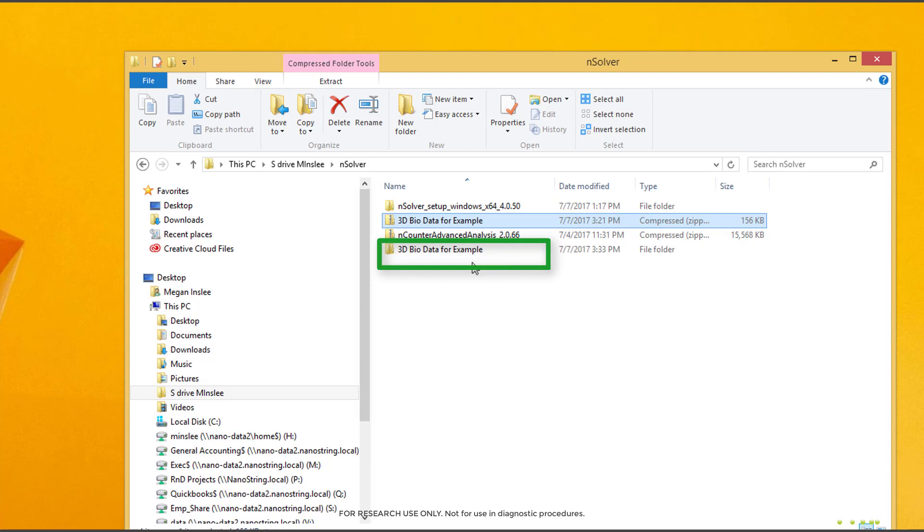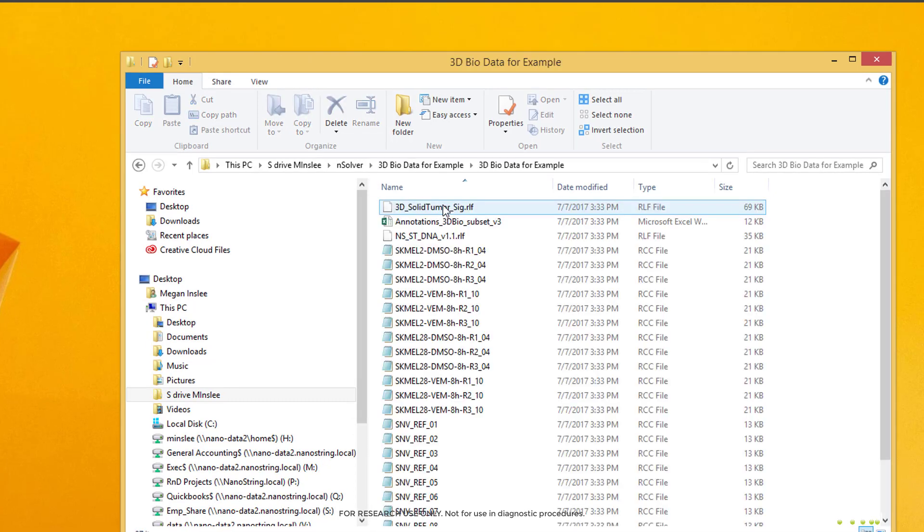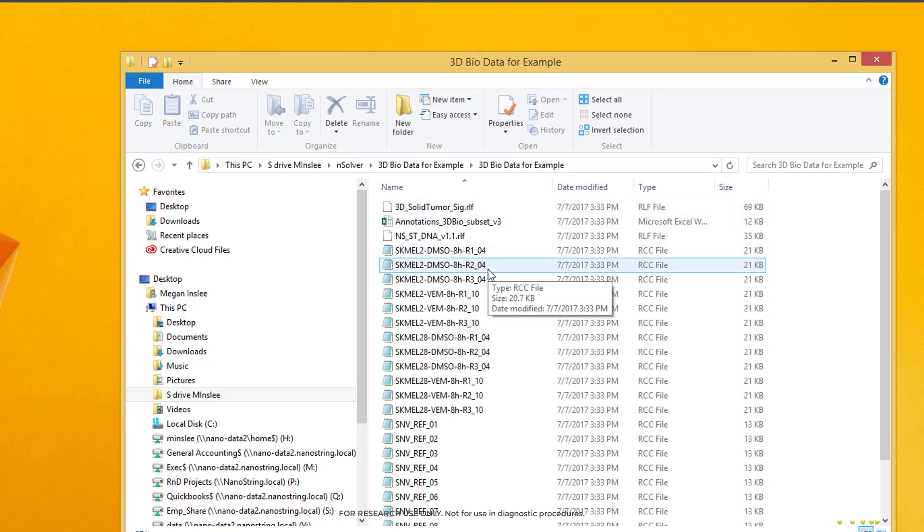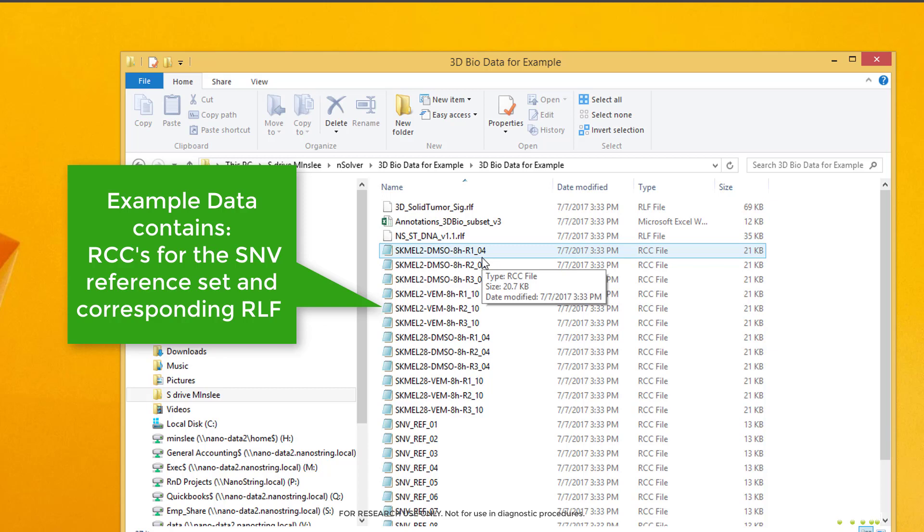We should see an uncompressed folder with the same name as that data file appear. If we open that, we should see one RCC file for each sample. In this dataset for ease of use, we've added the RCC files of the SNV reference set that we ran on a different run, as well as the RLF for each run in this file as well.